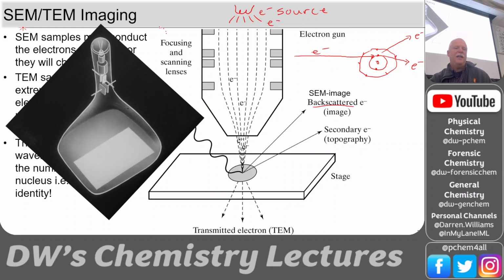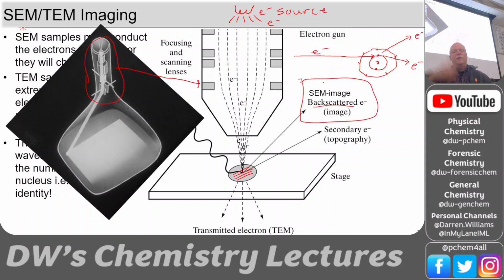And so we could take that same kind of element and put it in our scanning electron microscope, and that's the scanning part, and we could just scan those electrons across the surface and look at how many electrons bounce off and hit our detector. And you can produce an image that way. Now, the one problem with this is, notice we're throwing a lot of electrons at our sample. What if our sample doesn't conduct electricity?